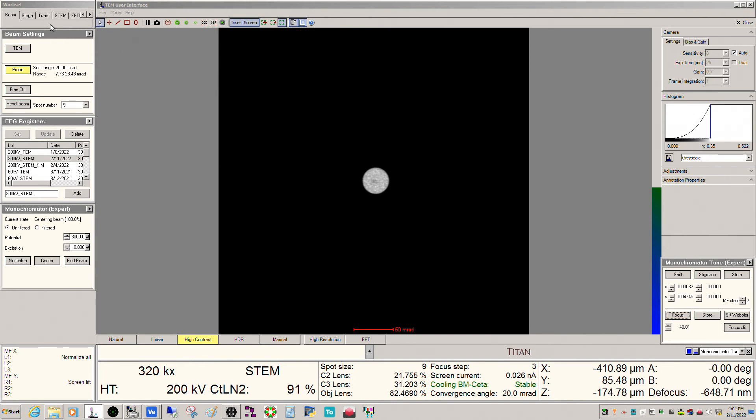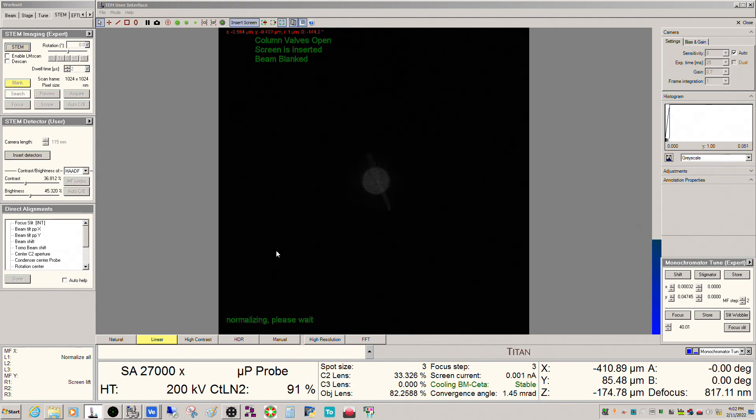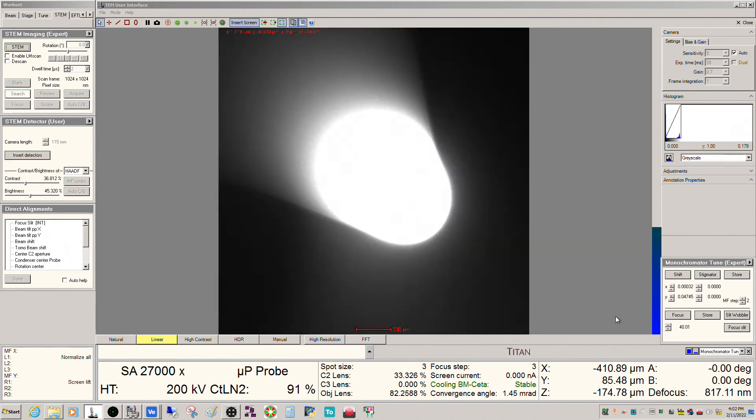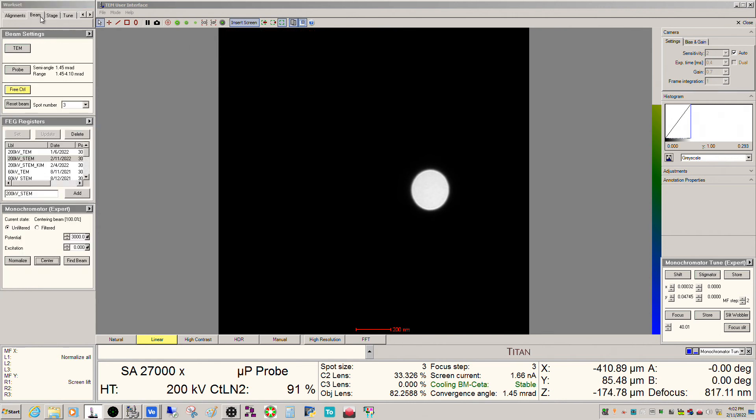I'll go ahead and put this back at 40 — you can see that was giving us about 25-ish picoamps. Getting back out of STEM mode, the monochromator shifts should be fine switching between modes. The shift shouldn't be an issue when you swap modes — that's not something you have to redo necessarily when you go from TEM mode into STEM mode.